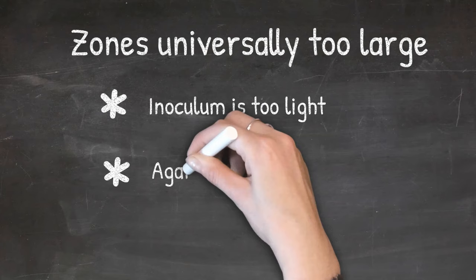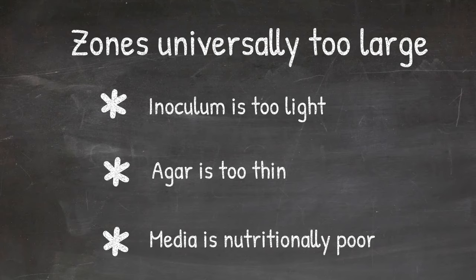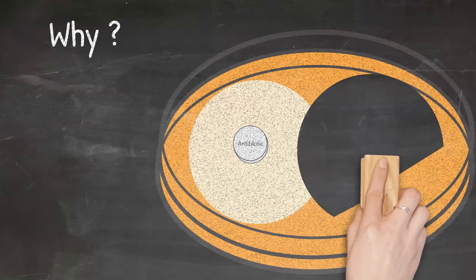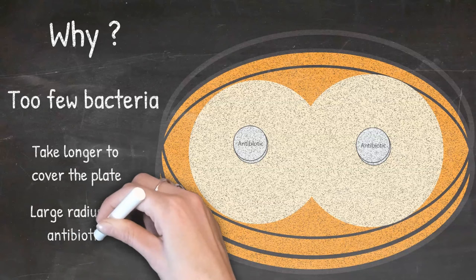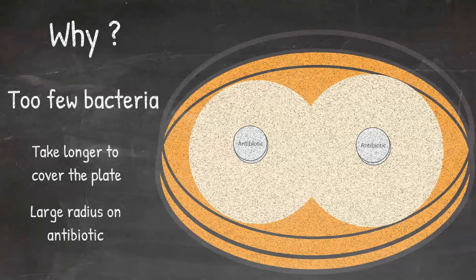Inoculum is too light, the agar is too thin, or nutritionally poor media. Why is that? If the inoculum is too light, then it would take the bacteria longer to grow to cover the whole plate. But the antibiotic diffuses at the same rate. This leads to a larger zone of inhibition than expected.